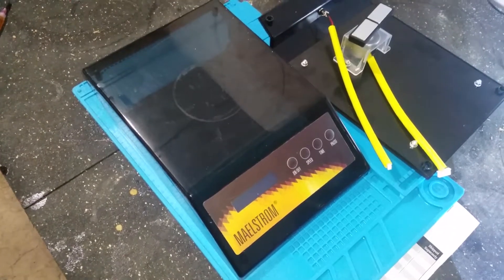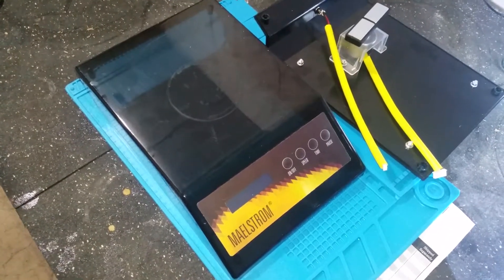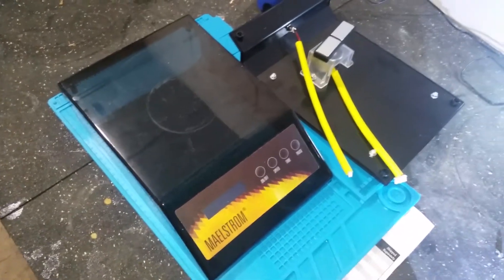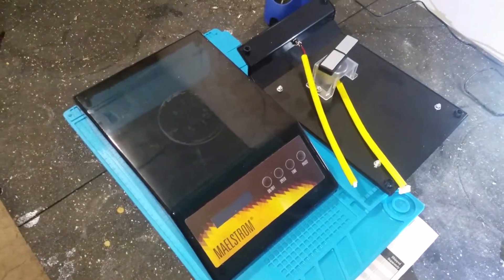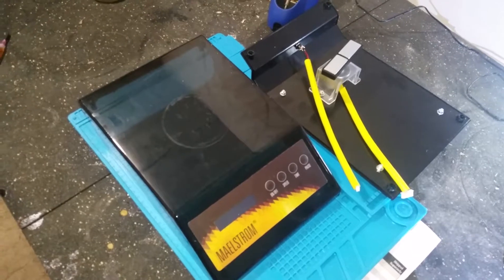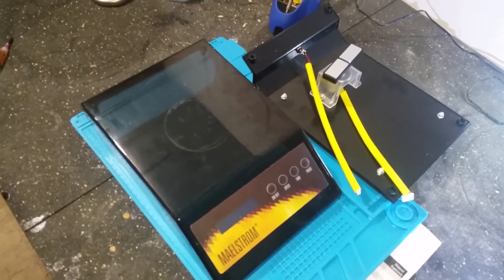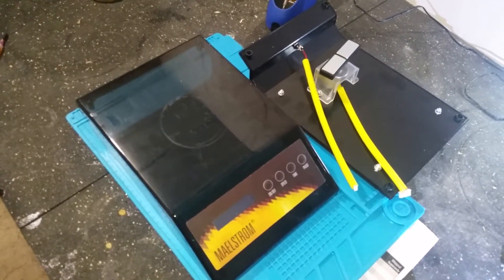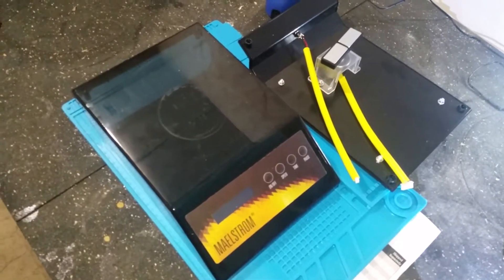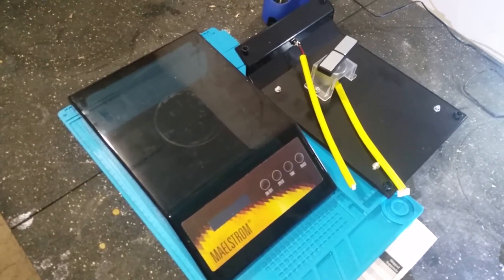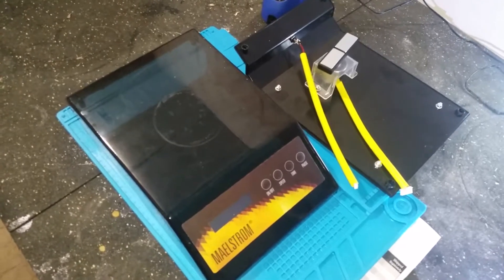I realize the instructions say don't open it up or you void your warranty, but this is why they don't want you to open it up. There's no security screws so I don't think they'll ever know.